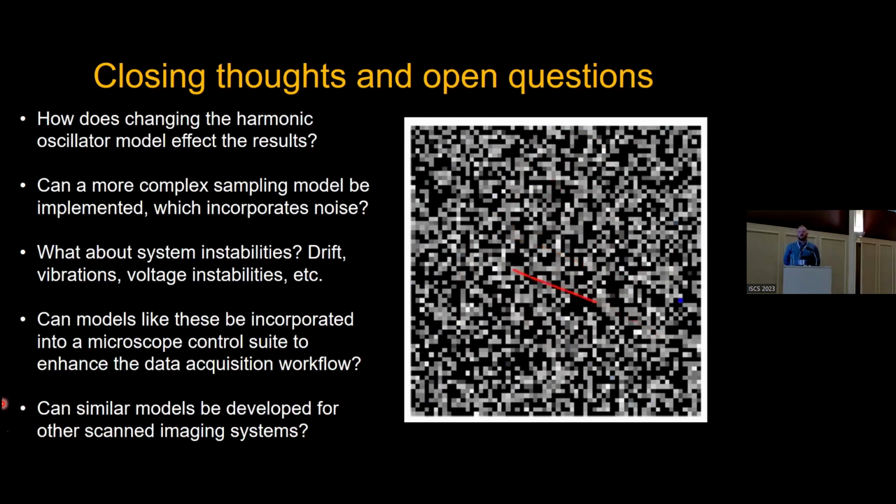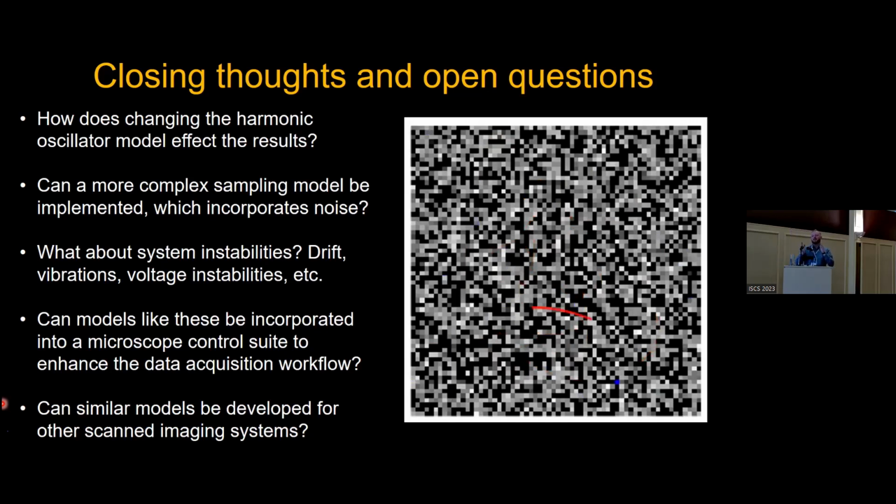Okay. Yeah, so if you imagine, I'll do it in my hands because it's easier. This is your scan coordinate, and we're treating it like a step function, moving like this. Actually, the beam is probably somewhere just behind, okay? So it's not directly incident and it's not linearly behind either. It probably looks like this. So you can imagine there that when you're traveling from left to right, you're always slightly off kilter. Now, when you're traveling right to left, you're off in the other direction. And so essentially you're getting two images that are off by some phase amount.